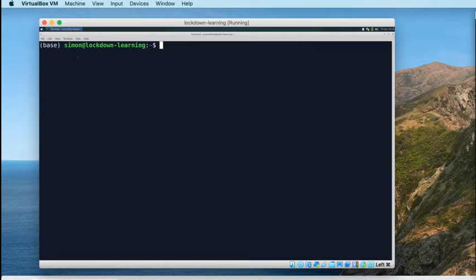We're going to download some data. And in order to download that data, we certainly want the SRA toolkit to be able to download the data that we need for doing our alignments later on. We're also going to download a reference genome as well. So for that, and also for the tools that we're going to use when we come to do the alignment, we want a conda environment. So we want to establish a new conda environment for that work.